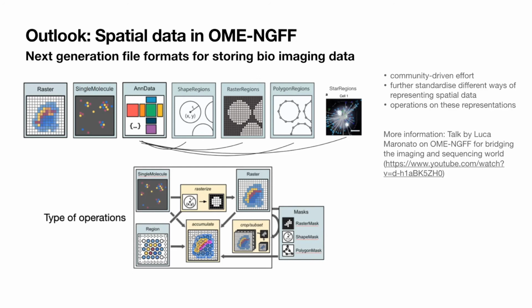So this is where we want to go, to standardize the way of representing, especially, the images. I think for the graph representation, everyone agrees that AnnData is a really nice way. It's just the images that we're still struggling with, because it's not so nice to just store them in the AnnData. They can get very large, like I already said.